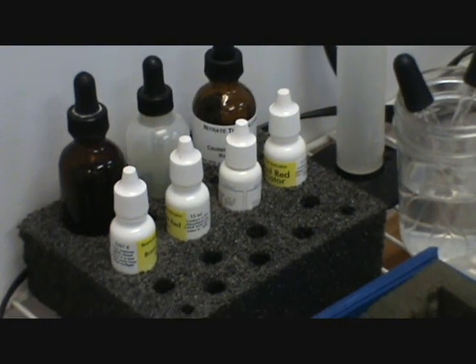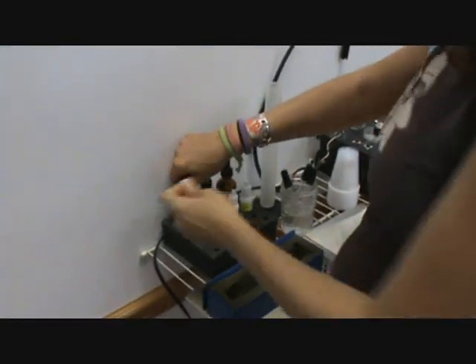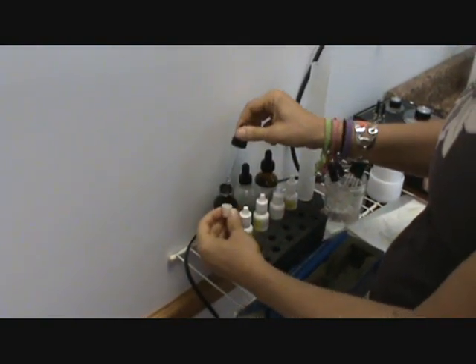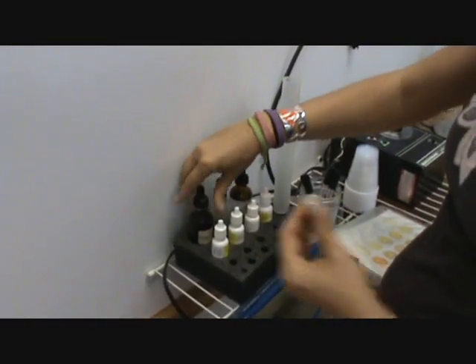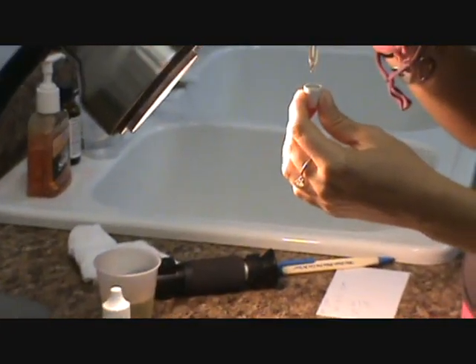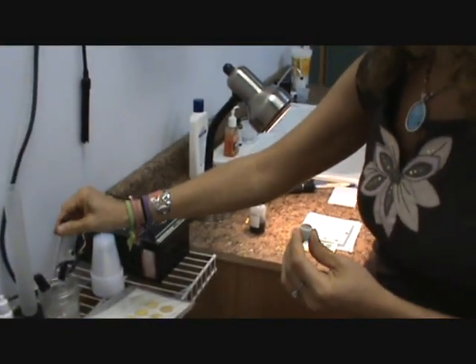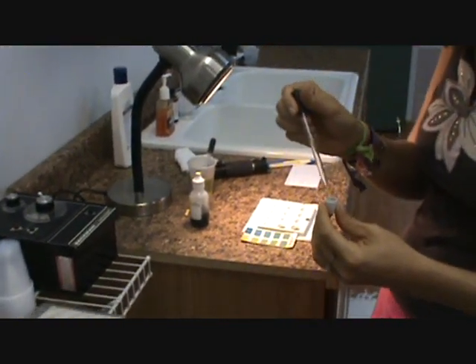Okay, now it's time to do the ureas. This is definitely the trickiest part of doing the numbers with the most interpretation required. So we're going to take the universal extraction solution. I usually just leave it in the block. We're going to take 6 drops — 1, 2, 3, 4, 5, 6. Make sure that you put all the drops back into the bottle before you put the dropper in, otherwise it'll corrode the top of your dropper. And then we're going to take 1 drop of urine and add it in there.